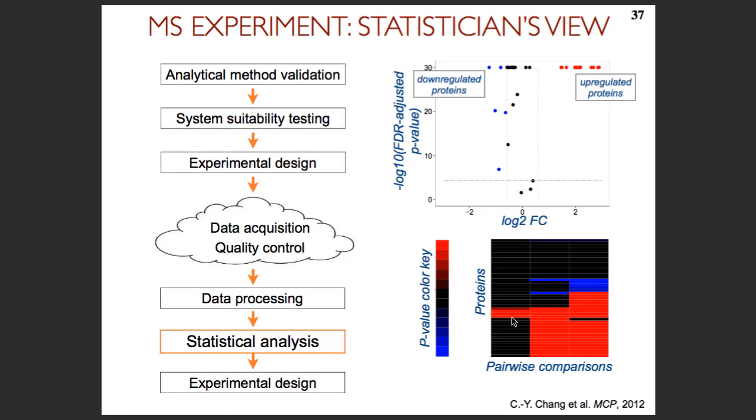And so then we would do essentially exactly the same type of thing, except that our models will have to be somewhat more complex to reflect more complex designs. But at the end of the day, we will use these models to build the signal-to-noise ratios. So we'll describe the variability, we'll describe the signals.